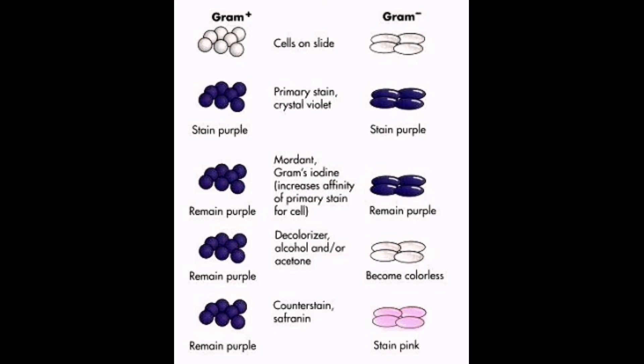When decolorizing takes too much time — more than 15 seconds — take note that both gram-positive and gram-negative bacteria will become colorless if we do not perform the decolorizing step correctly.